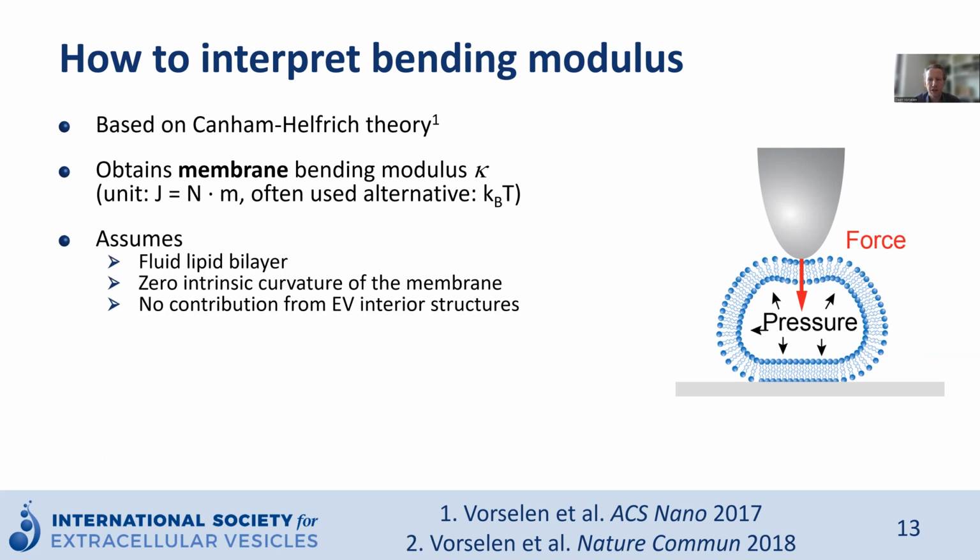Similar to the thin shell model, it assumes that the outer shell is the only structural contributor to the EV mechanics. But unique among these models is that it takes the fluidity of the lipid bilayer into account, meaning that it doesn't treat the lipid bilayer as a solid or isotropic material, but as a 2D fluid, which is likely a more accurate physical description. Moreover, this model accounts for pressurization of vesicles.